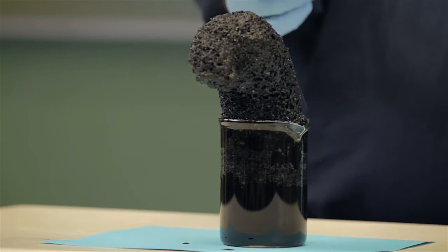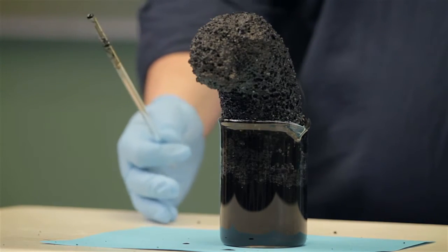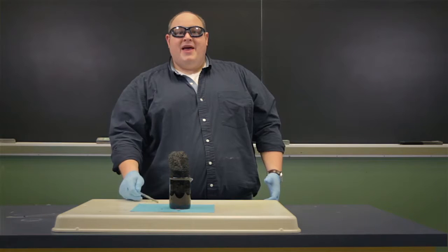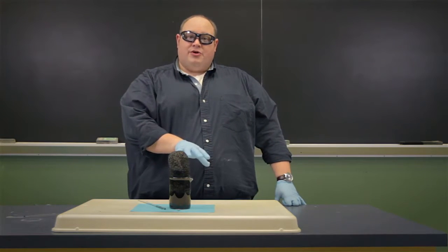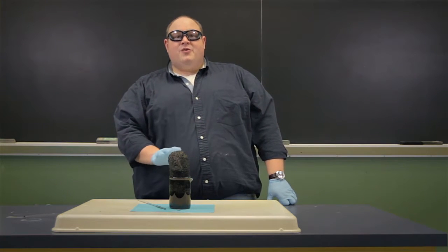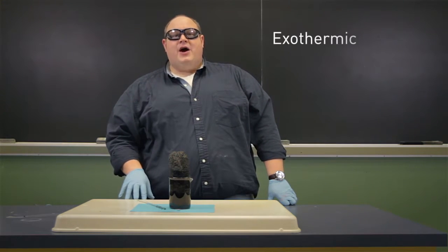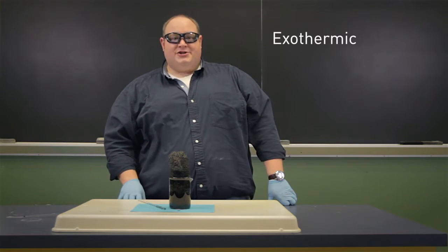This solid black gunk is what we're left with, and that's carbon. Based on this demo, do you think that this reaction was endothermic or exothermic? The steam that we saw rising out of the beaker helps us figure out this reaction. This was an exothermic reaction.